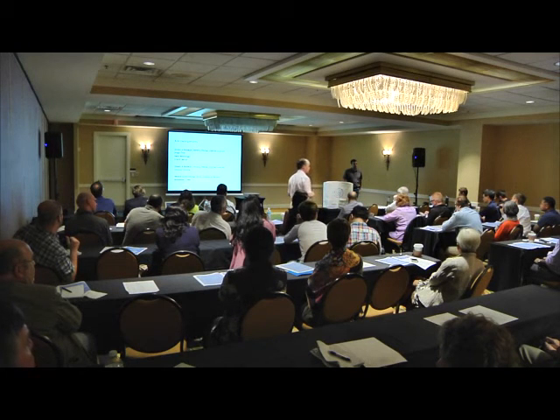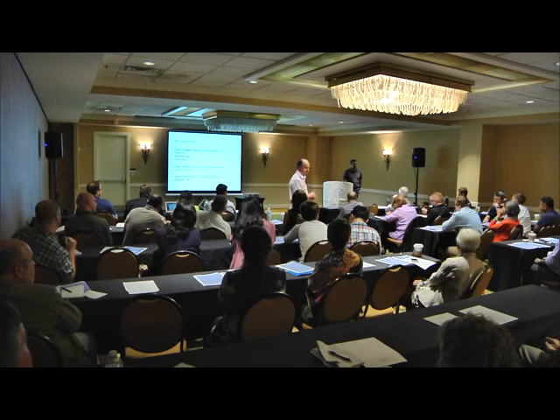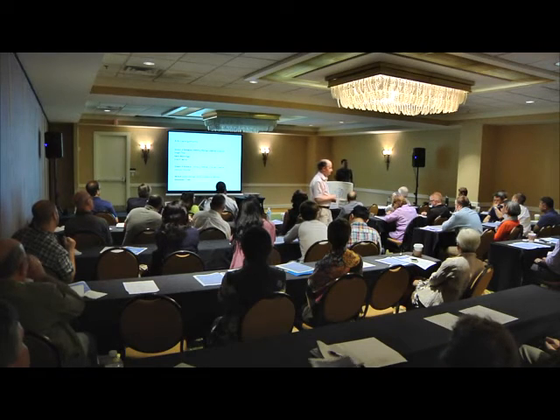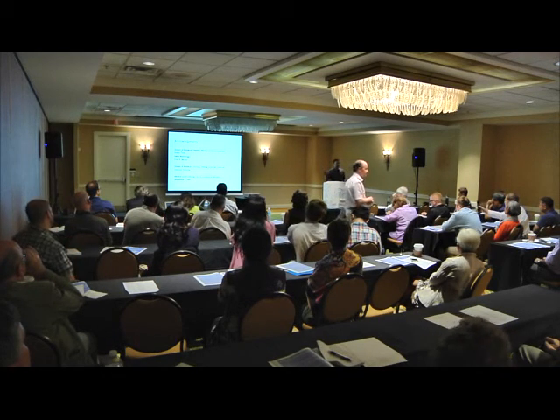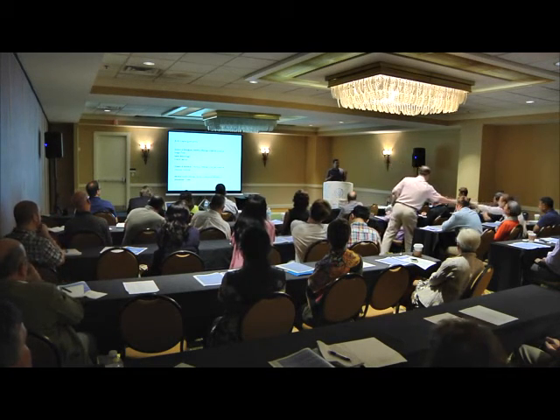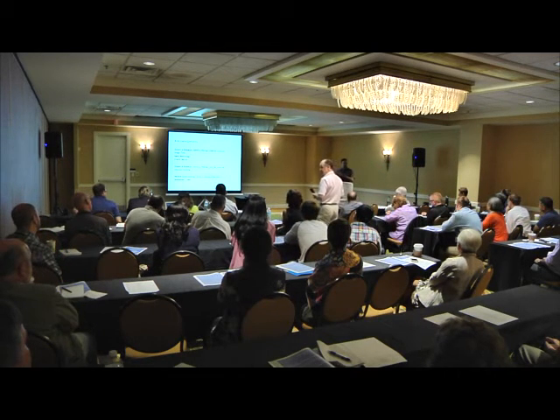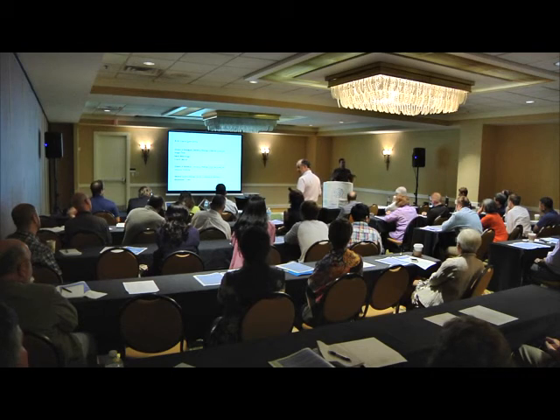So did you try to play with the fragmentation energies and see whether the propensity of your fragmentation pathway changes in response to that? I didn't show this here, but you not only have these three major fragmentation pathways that we have with our settings at the moment, but there are additional about 7 major fragments that you can get depending on how much energy you put into the fragmentation system.